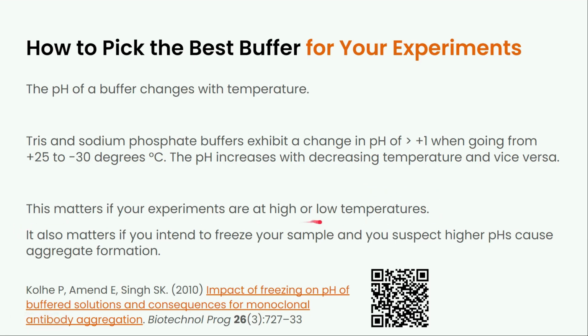Now this will matter if your experiments are at high or low temperatures. And it also matters if you intend to freeze your sample and you suspect high pHs cause aggregate formation if you're working on a purified molecule. For DNA, it doesn't really matter because DNA is rock hard. It can last for centuries, but delicate biomolecules, not so much. And you can read the full study by scanning that QR code or following that link.